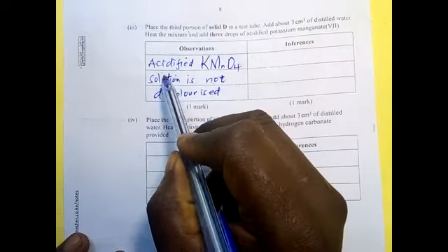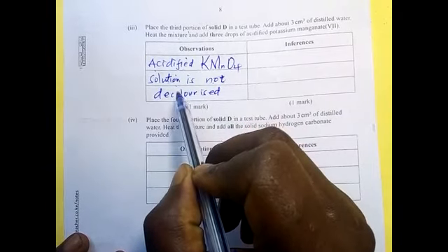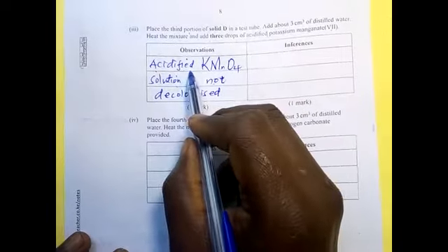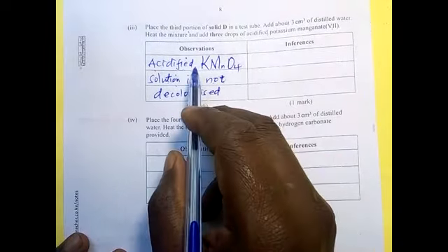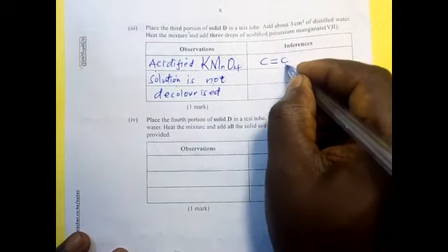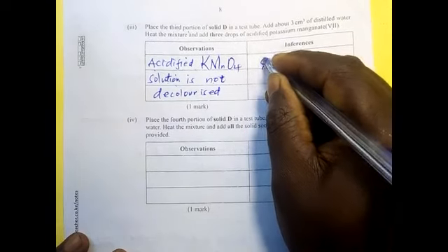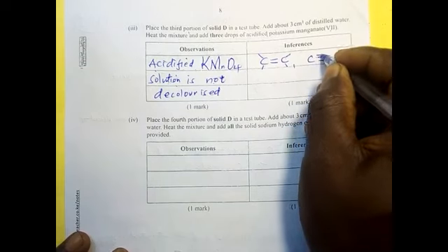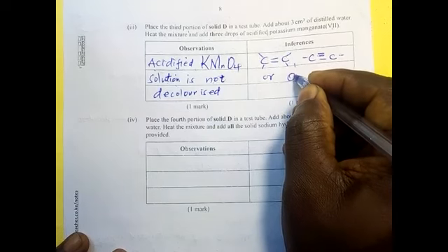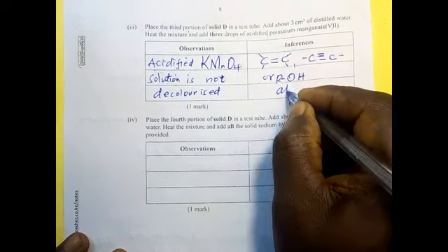Another person can say the purple acidified potassium permanganate remains purple because it did not change. We know this one is purple. So if it doesn't change, then it means that the double bond, the triple bond, or the alcohol ROH was absent.